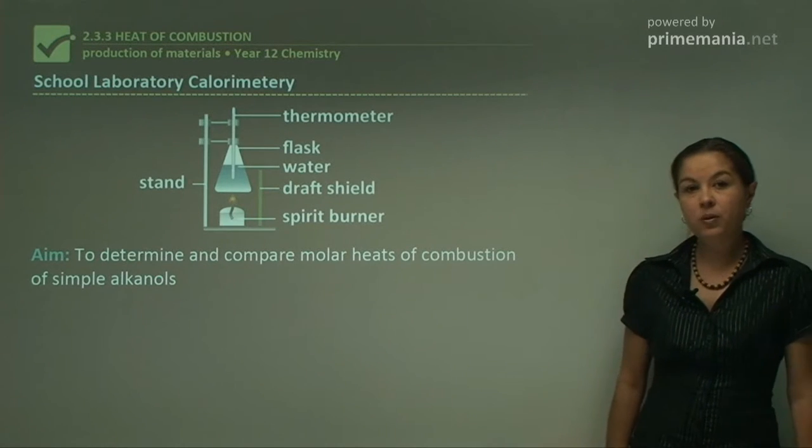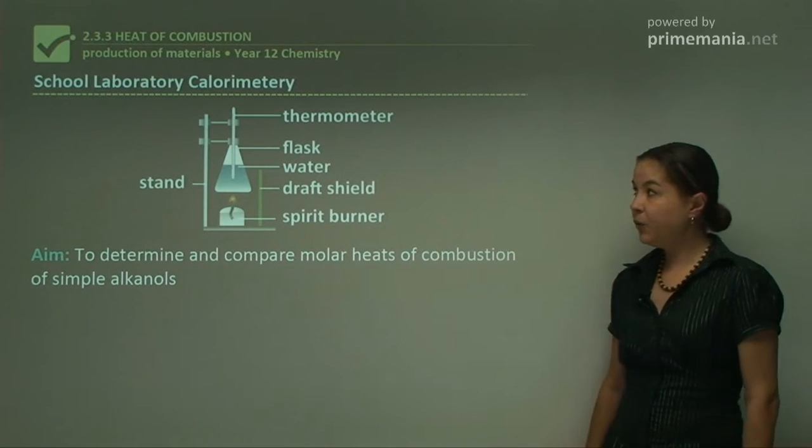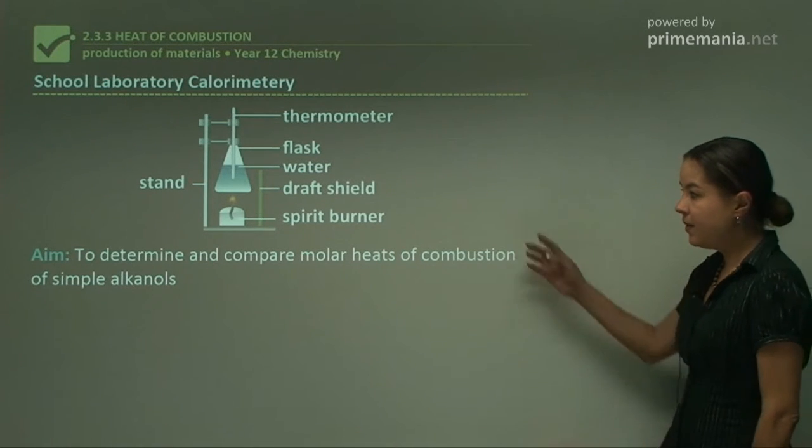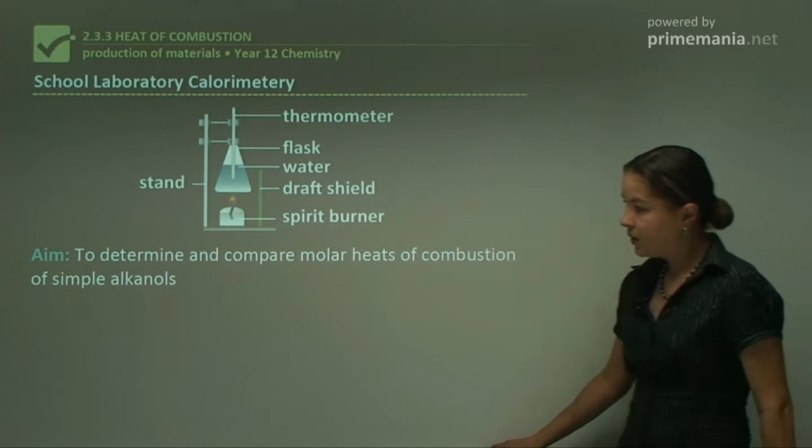So we're looking at school laboratory calorimetry. If you remember, calorimetry is a way of measuring the heat of combustion, and this is the setup here.